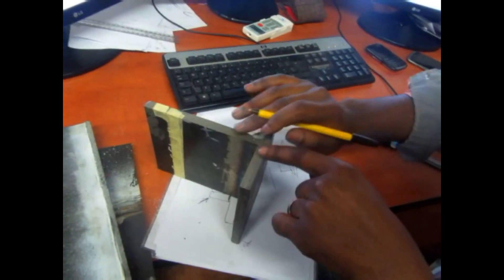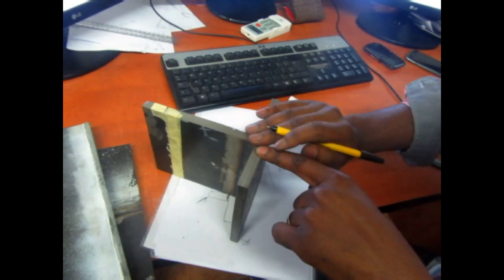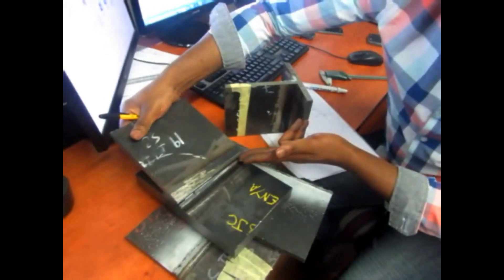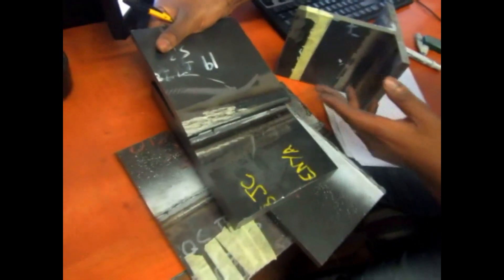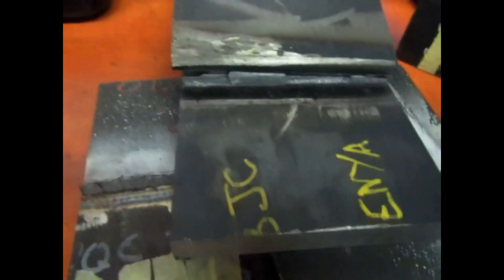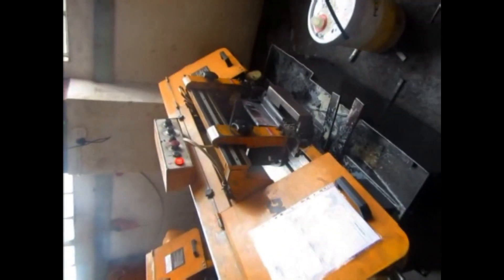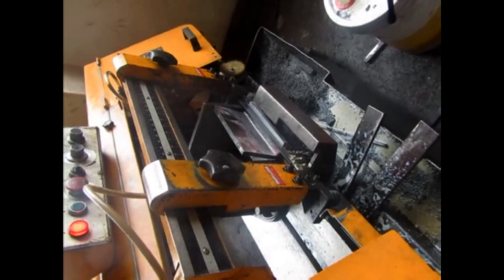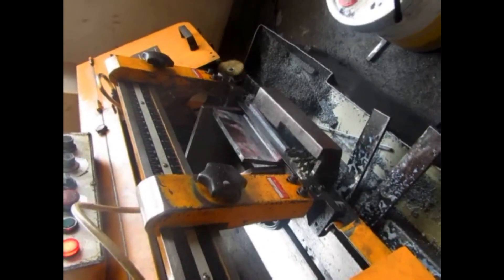Unlike the macro test, which focuses on the cross-section area of the tested piece, the fracture test focuses on the entire length of the tested sample. By opening the root, this provides a good indication of discontinuities within the entire length of the weld being tested.